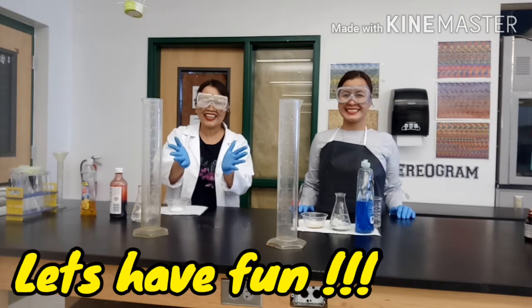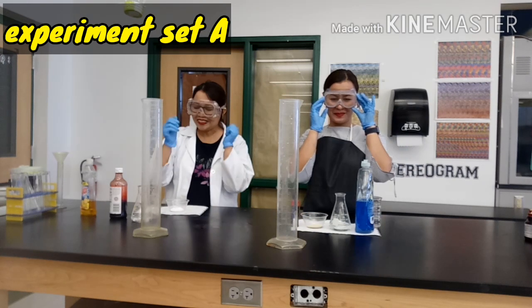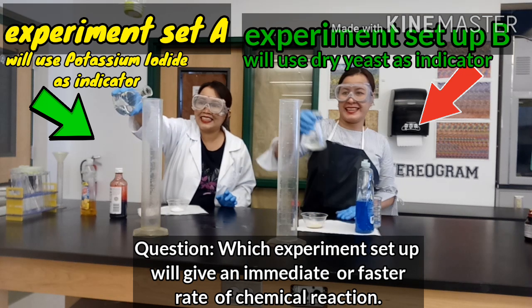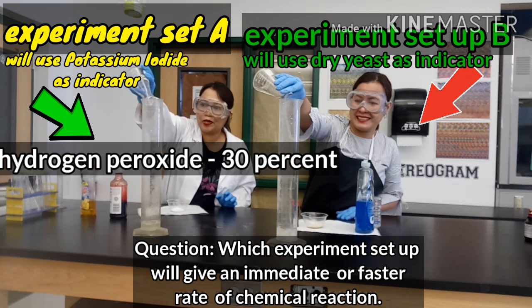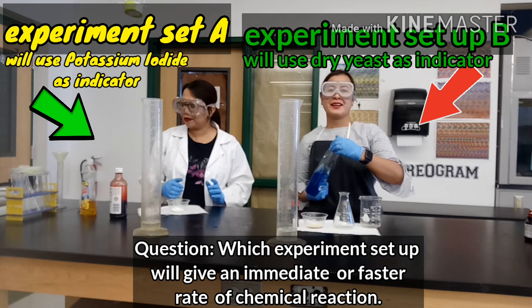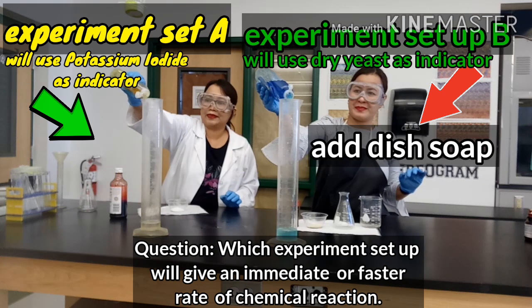Hello! So, are you excited for this experiment? Let's have fun and let's start it. Alright, let's go! So first, we're gonna put the hydrogen peroxide. This is a 30% hydrogen peroxide, so be careful. You're gonna burn your skin. The next, Miss G, what are we going to add? Let's add the dishwashing soap. The dish soap.